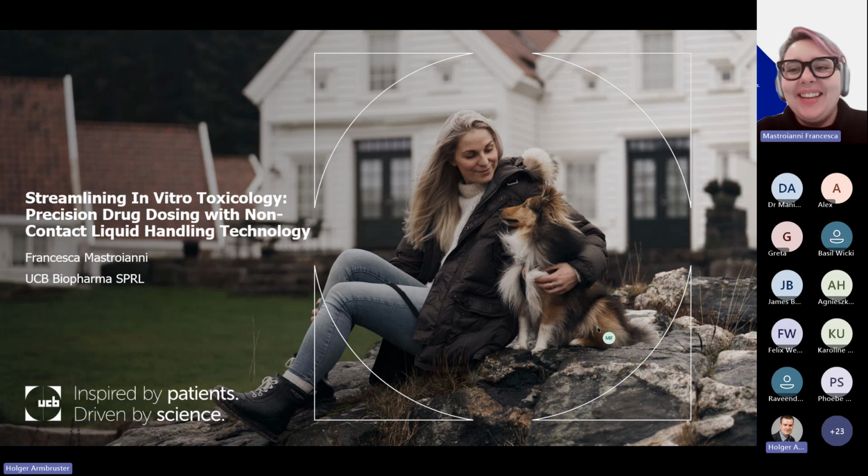Thank you. Okay, so good afternoon, everyone, and thank you for joining this webinar today. So I am going to share with you our advancements in streamlining in vitro toxicology through precision drug dosing by using non-contact liquid handling technology. So today I will walk you through the journey that brought the I.DOT into our laboratory and how it has changed our workflow. So let's move on to the agenda for today.